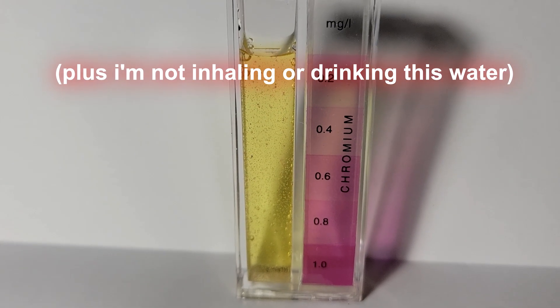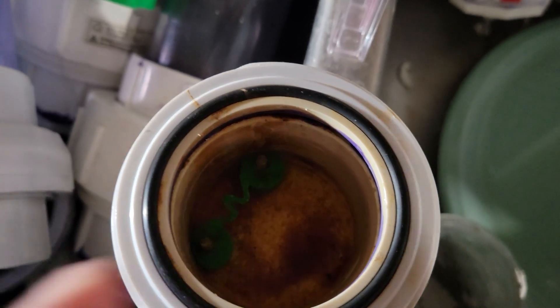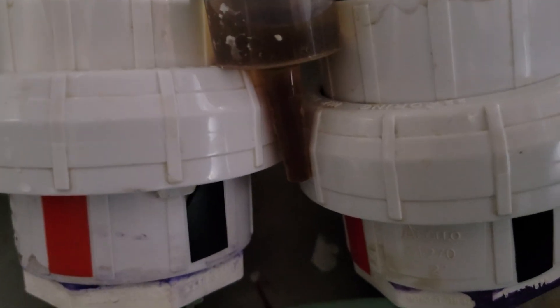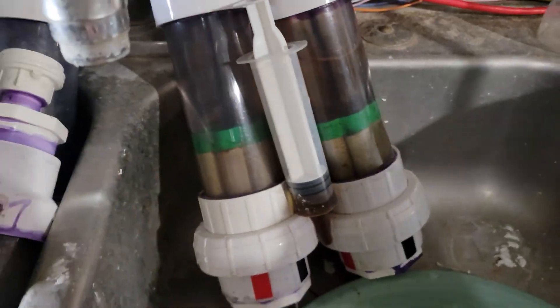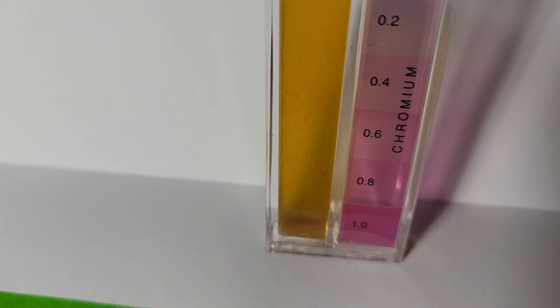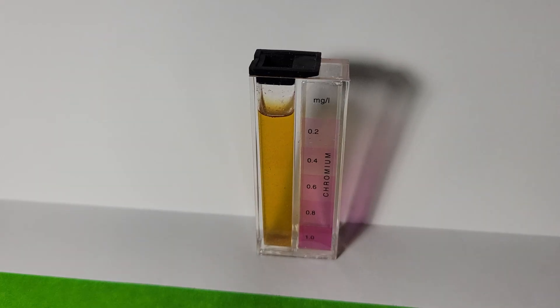Especially since that first one was pretty thoroughly mixed up, we'll do a concentrate here and see if we can get a reading on that. Two hours later — I took a syringe and extracted all of the dredge contaminants at the bottom. I'm going to let them settle in the bottom of that syringe and fill this thing up with hopefully a very concentrated sample for testing. There's quite a bit of sediment in this one, up to maybe the 0.8 mark.